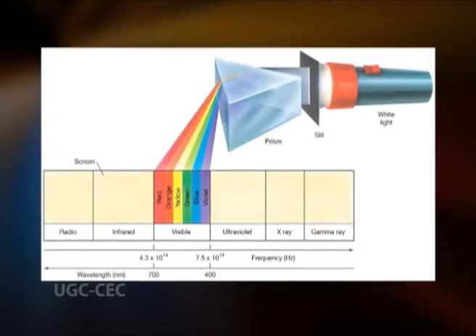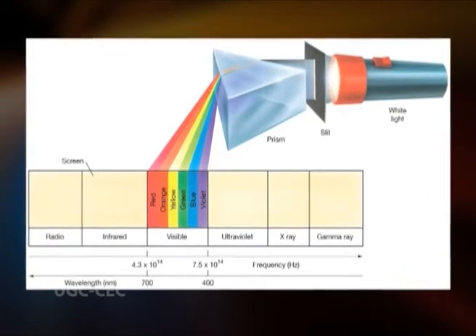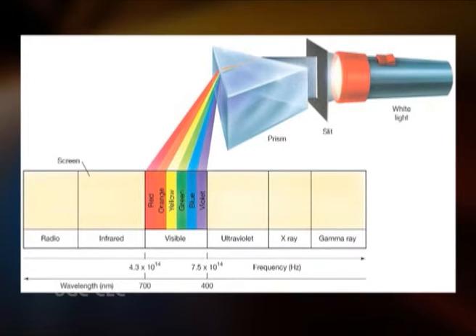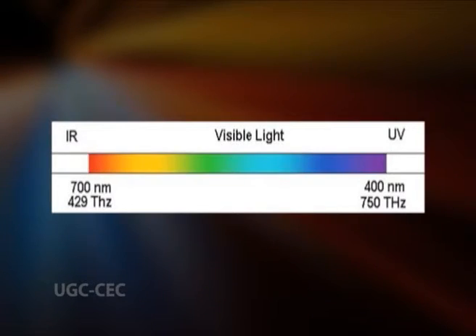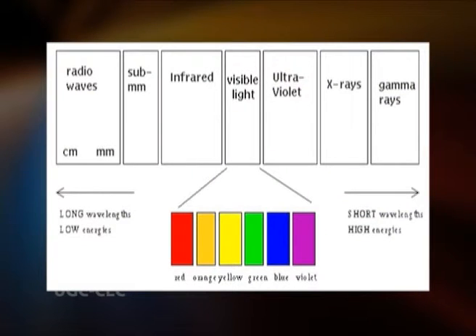Light is an electromagnetic radiation, a phenomenon exhibiting different energies, and dependent on that energy, different molecular features can be probed. An understanding of properties of electromagnetic radiation and its interaction with the matter leads to appreciation of variety of types of spectra and consequently different spectroscopic techniques and their applications to the solution of biological problems. Spectroscopy is the study of interaction between matter and electromagnetic radiation.